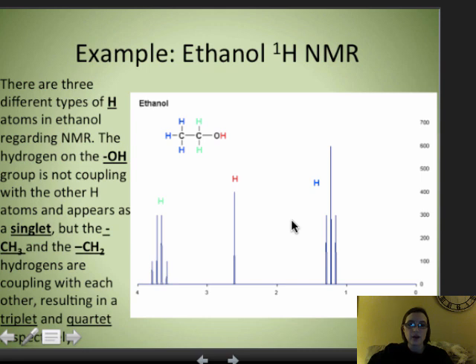However, the CH3, so here's the CH3 peaks over here, and the CH2 peaks are coupling with each other. What that means is they're actually close enough in the molecule to have an effect on the other's electronic environment. And so they actually split the peaks. And what happens is we get a triplet here. So the CH3 gives us the triplet, and we get the quartet here as well.